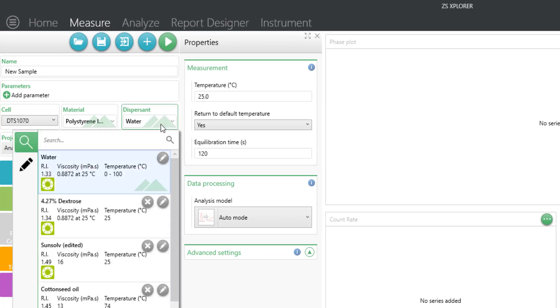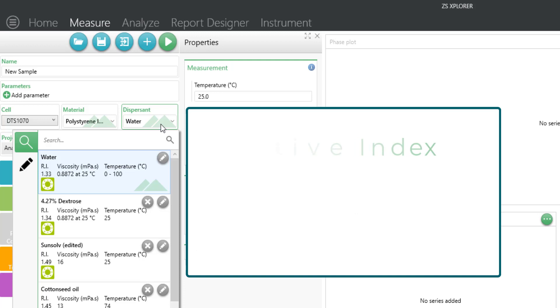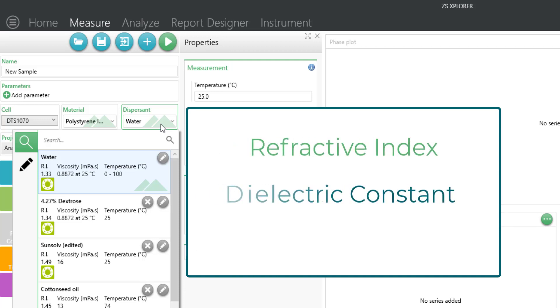Next, select your dispersant. The software will provide options within the library for compatible dispersants based on the cell type you have selected. The dispersant menu uses data for the refractive index, dielectric constant, and the viscosity at the measurement temperature.